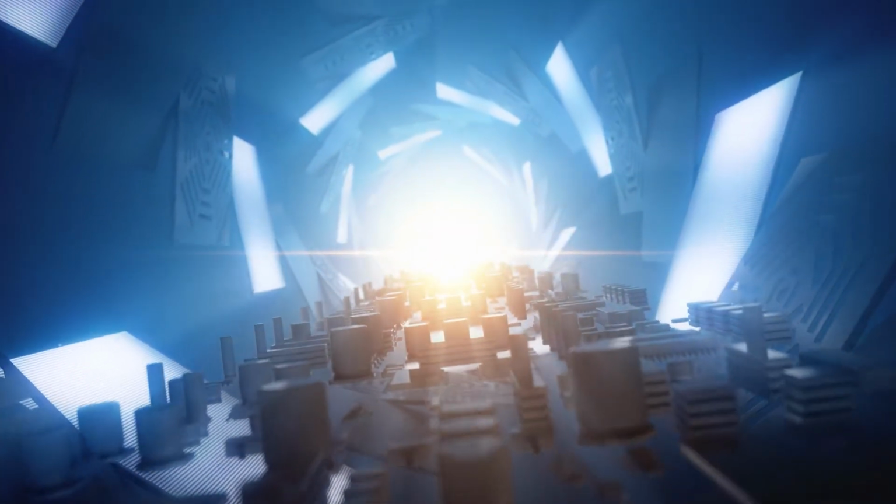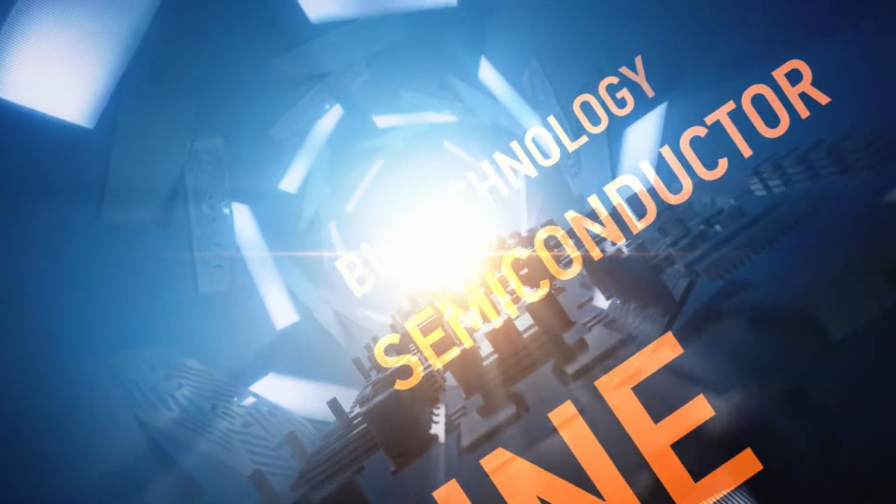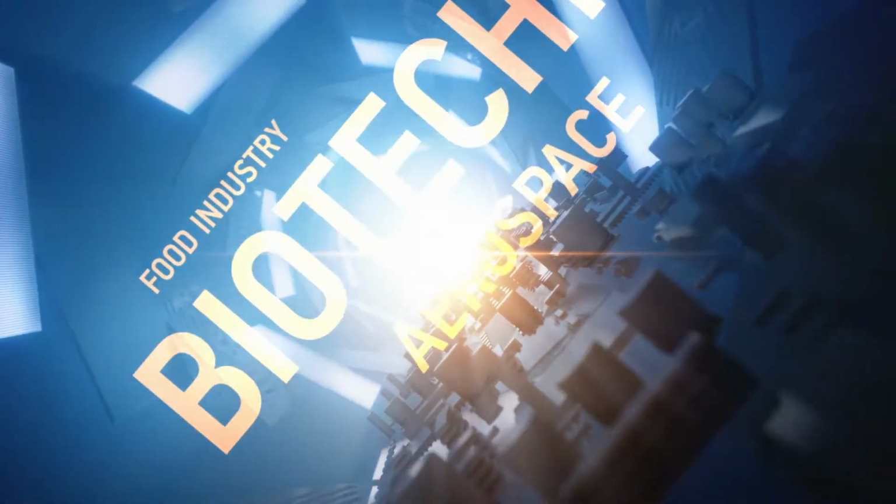A dance of specks of dust in the light. Such an effect can be observed even in the most thoroughly cleaned room. Not thousands, not even millions, but billions of particles, each one of which can be fatal in the case of high requirements to air cleanliness.